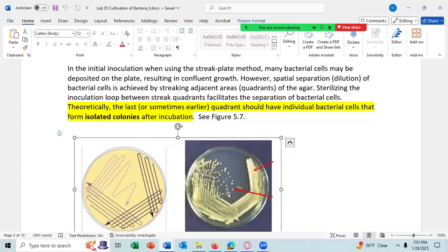And that's not good enough for microbiology. You need to streak it out 2 times and then take cells that went through 2 colony isolation events. And then your chance of getting a pure culture will be 95% or greater. And that is good enough for microbiology. You can never be certain that you obtained a pure culture to 100%. That's just the facts of life and biology.